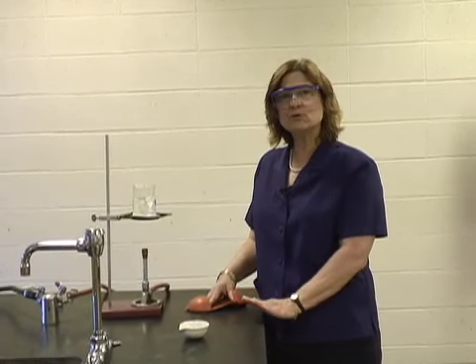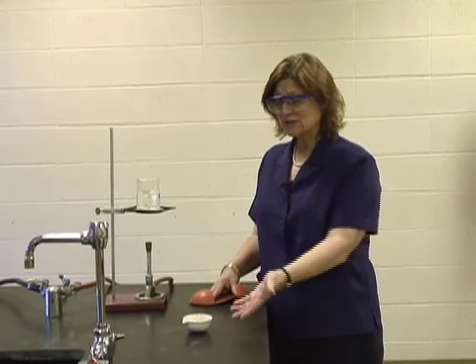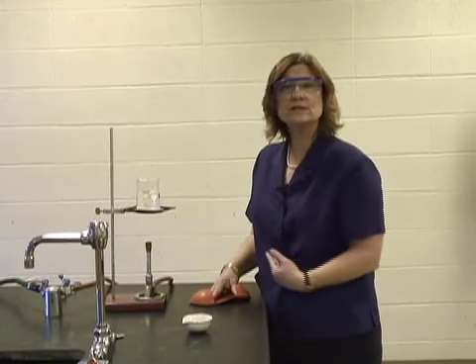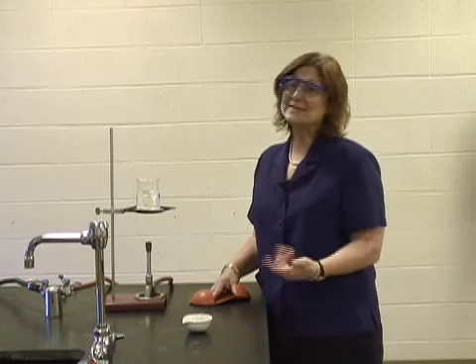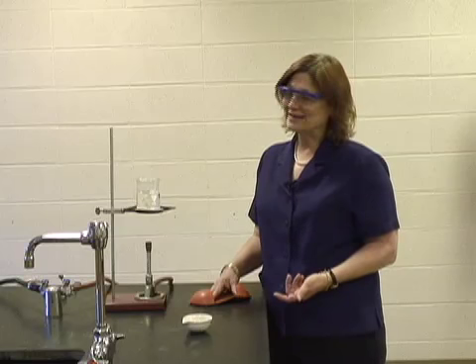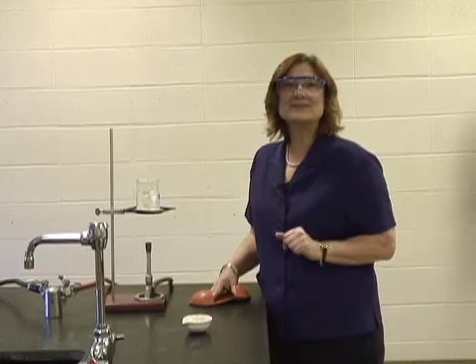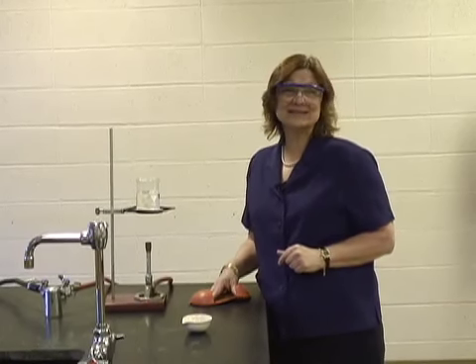Now oftentimes students want to go ahead and weigh it, but we cannot weigh anything on the balance or scale that is warm at all. It must be completely cooled for 2 major reasons. One is that hot air rises, and the scale will have a very difficult time reading the mass when the hot air is pushing the evaporating dish up. And secondly, it's just not good for the scale. So we don't do that. So I'm going to go ahead and cool this down, and I will see you at the scale, and we'll find out what the mass of the copper is.